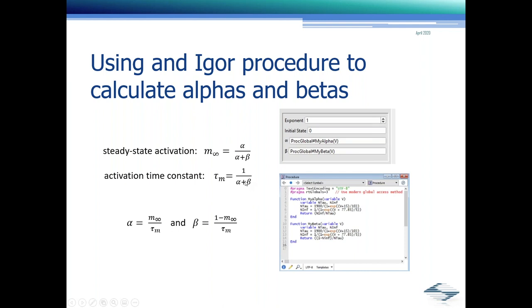One of the cool things about living inside of Igor for Sutterpatch is when you enter those equations, rather than entering it as an equation, it's possible to enter a call to an Igor function. Why might we do this? Oftentimes people, when they're entering in gate equations, they say, well, I'd rather, I've got values for my steady state activation and activation time constants. I don't know the alphas and the betas. And while these variables are interchangeable, as you see here, it's not always trivial to be able to calculate out what this would be. So in fact, here, this is an example that I've shown of a way to be able to convert from one to the other. And simply what we do is we call an Igor function that you write. These are called instead of parsing the equation, and it allows you to come to the same output as you would otherwise. This is just to show basically for people who have experience programming inside of Igor, really the sky's the limit as far as the power and the capabilities that you have.